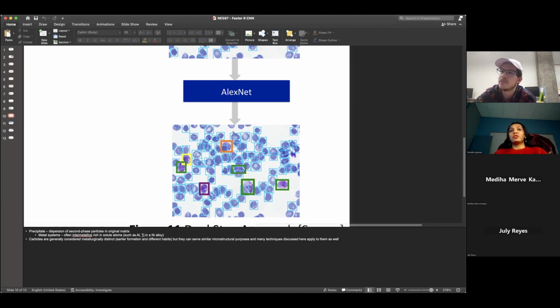So if there was a shortage of data, I would prefer techniques like data augmentation. Yep, data augmentation was done in this data set as well to try and improve the data set for the non-red blood cell cell types.